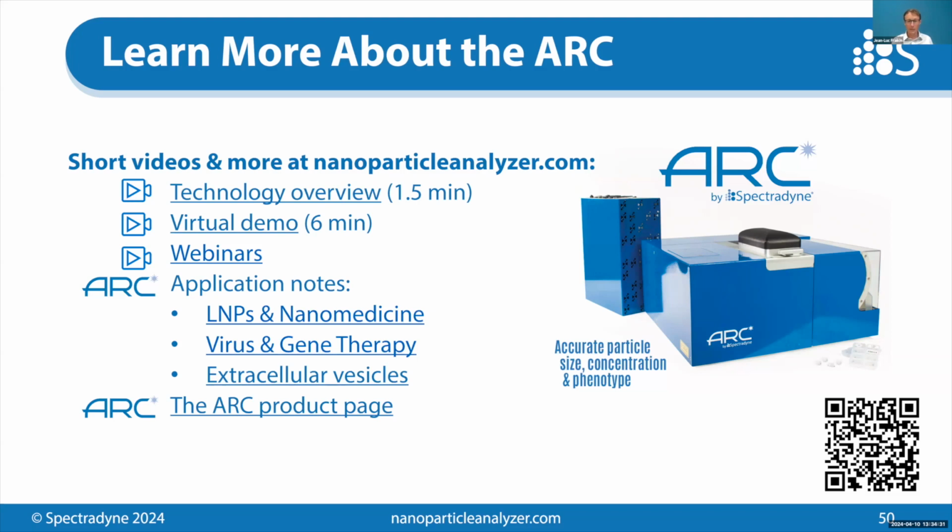Next question is from Luis Perez. Is hydrodynamic diameter what Spectradyne measures as true particle size? Okay, so this is a very good question, and the answer is no. We're not measuring hydrodynamic diameter. So hydrodynamic diameter is the diameter of a particle that diffuses in the way that's observed, right? And so a lot of things can affect the hydrodynamic diameter without appreciably actually changing the particle size. What we measure is just the core particle itself.